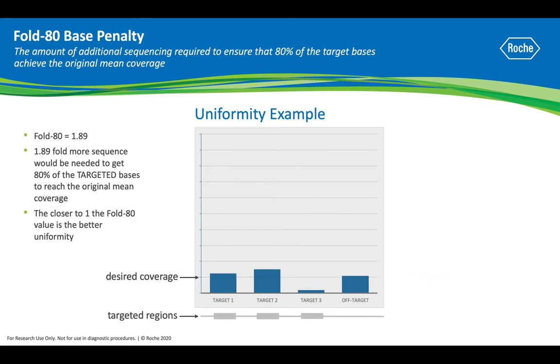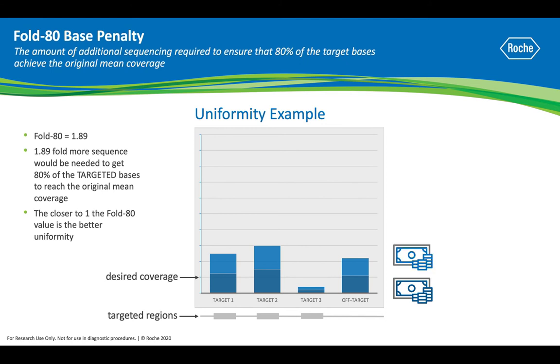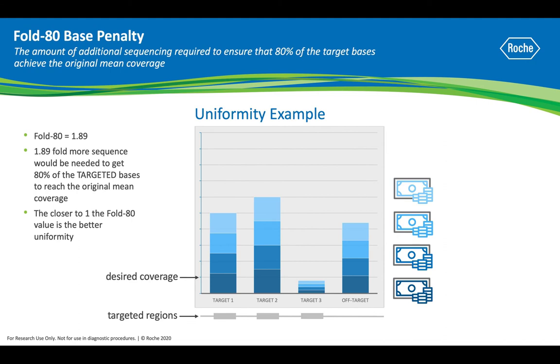This chart shows an example of what you might see from a target enrichment analysis. Here, the Fold 80 Base Penalty was calculated at 1.89, which means 1.89 times the original number of reads is needed to achieve the original mean coverage for 80% of the targeted bases. In this example, two of our target regions exceeded the desired coverage, meaning wasted sequencing resources there, and the off-target reads are also unwanted coverage and result in discarded reads. The reads with too low coverage mean you will need to sequence more to get the desired depth for every target. Depending on how low the coverage is, you might need several additional sequencing runs to reach the desired coverage, resulting in over-sequencing of other regions. Thus, achieving a Fold 80 Base Penalty value close to 1 can greatly reduce the amount of sequencing you need to achieve the desired depth of coverage across your targets.